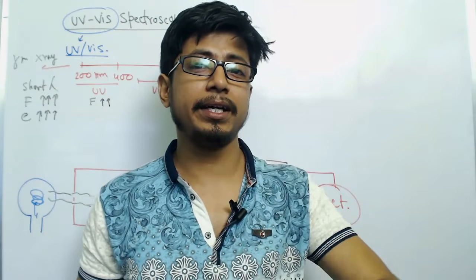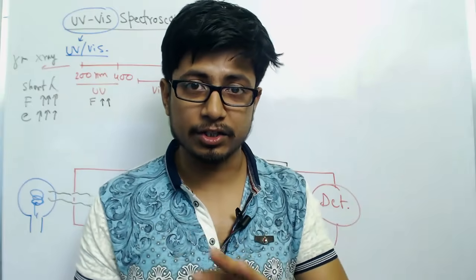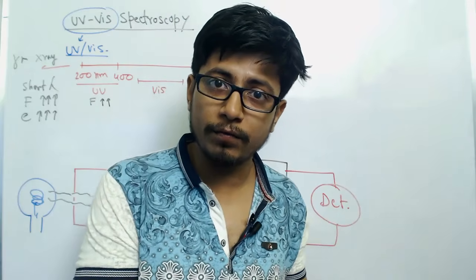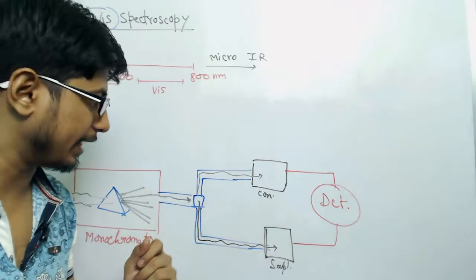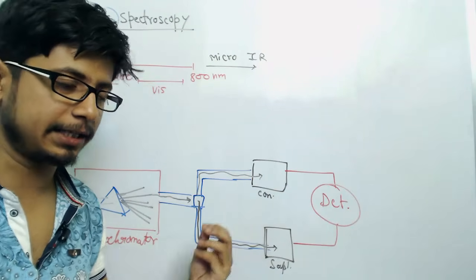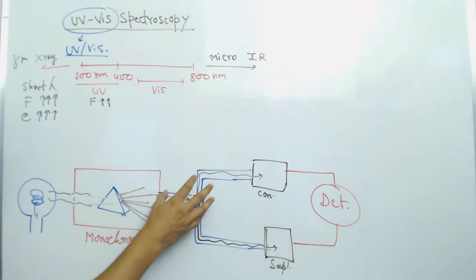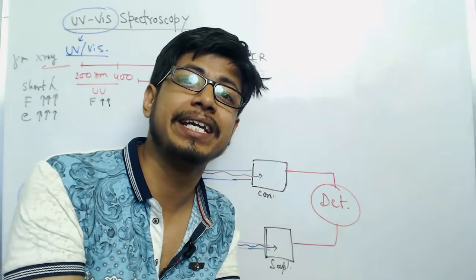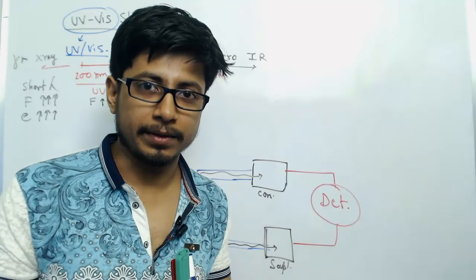One thing we know all our life is that energy cannot be created and cannot be destroyed. The only thing possible is transforming energy from one form to another. So in this case, the energy is absorbed, the energy is utilized at this point, in a more scientific way. If the energy is utilized, then the intensity of the light received is lost a little bit.